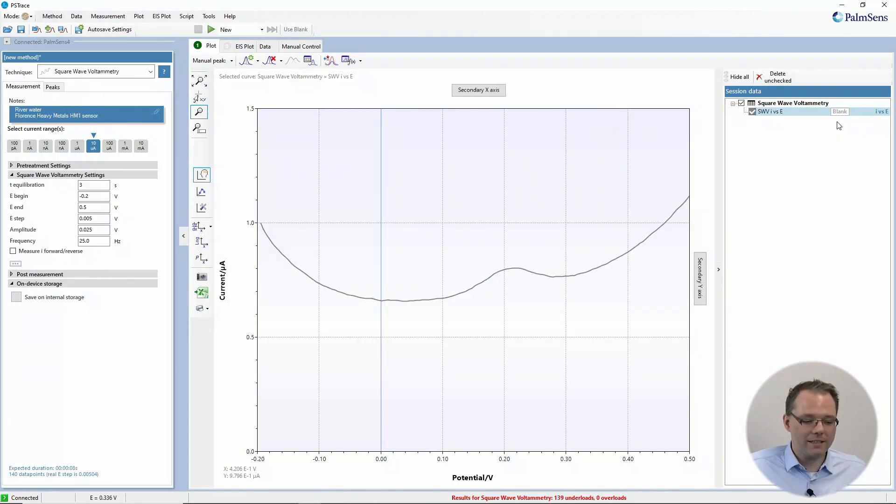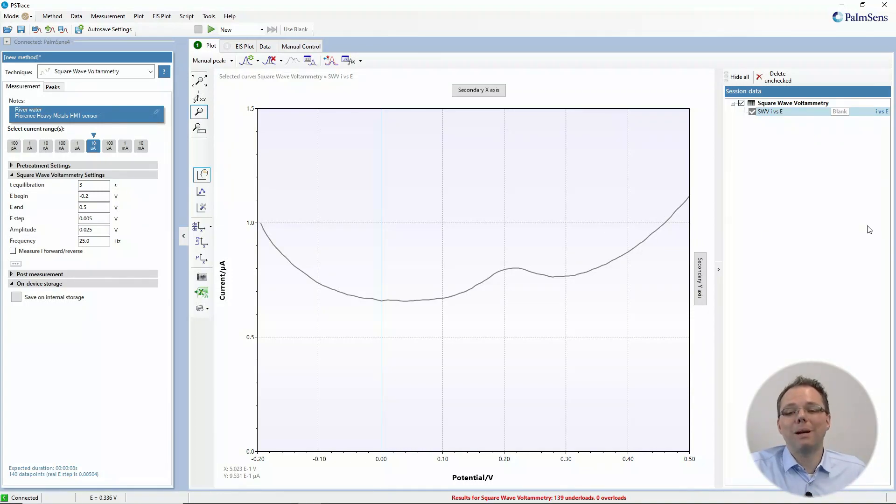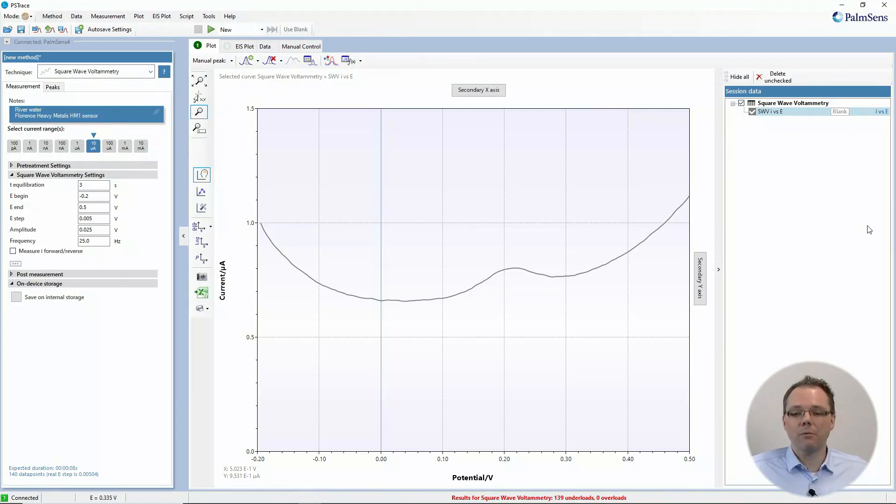It gets this little label and the curve is colored gray. We always color the blank gray because usually the blank is not the curve you're interested in and where you want to have 100% of the attention.